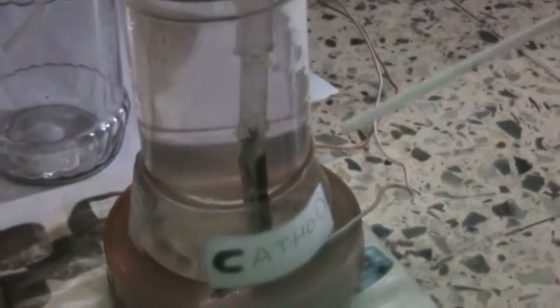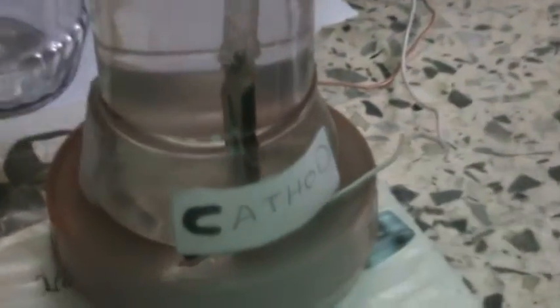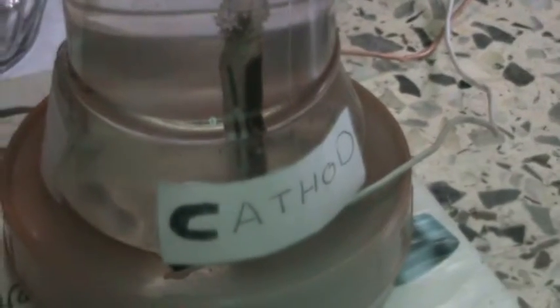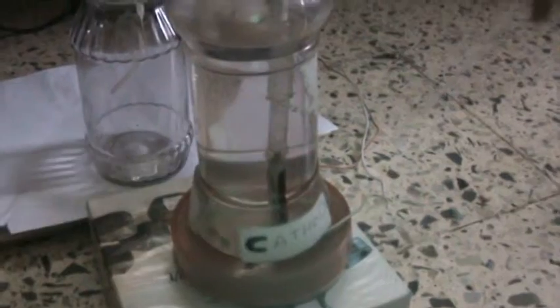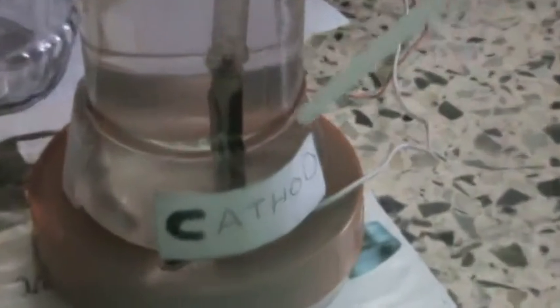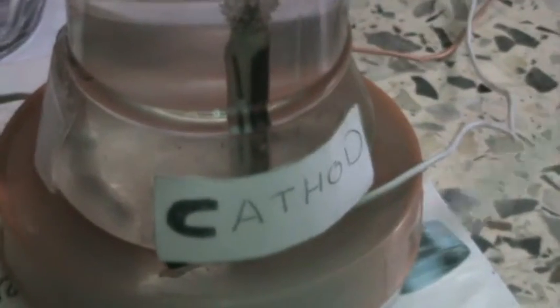Good morning. This is the electrolysis setup. This side is the cathode side. The white wire connects to the graphite electrode going downwards.